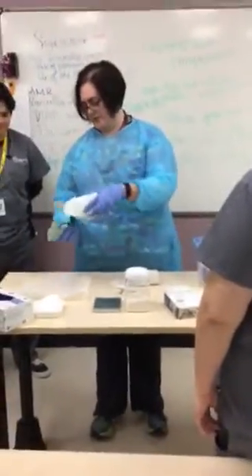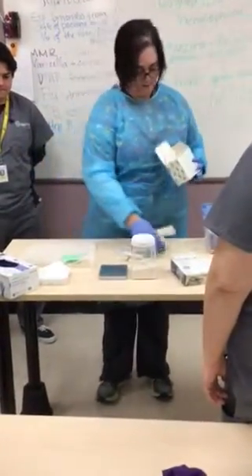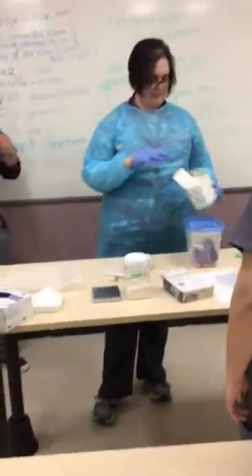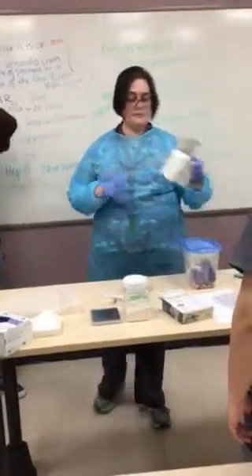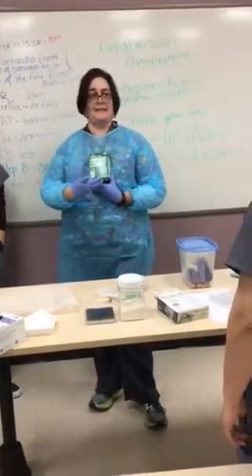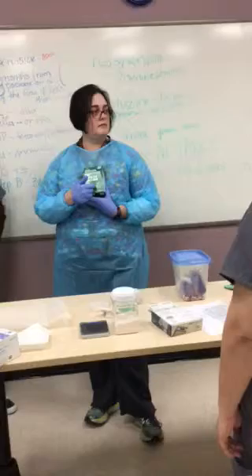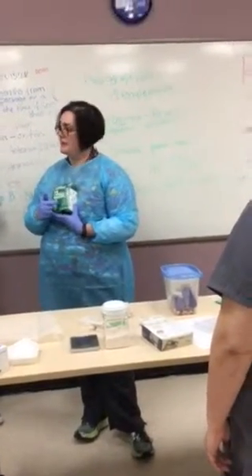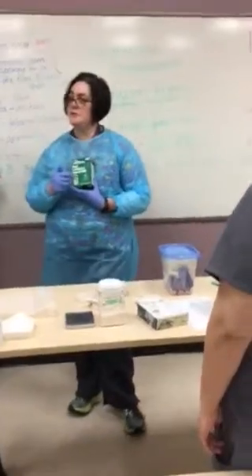I'll probably use that one because it makes less of a mess. And this one, you need to read the size — it's a double ought. You cannot use any other size in here because it doesn't fit. So you can only use a double ought.